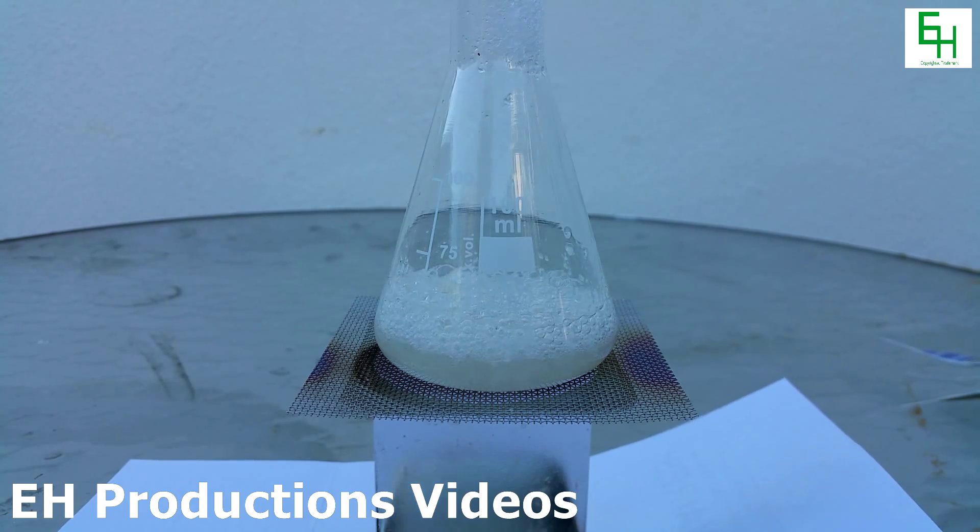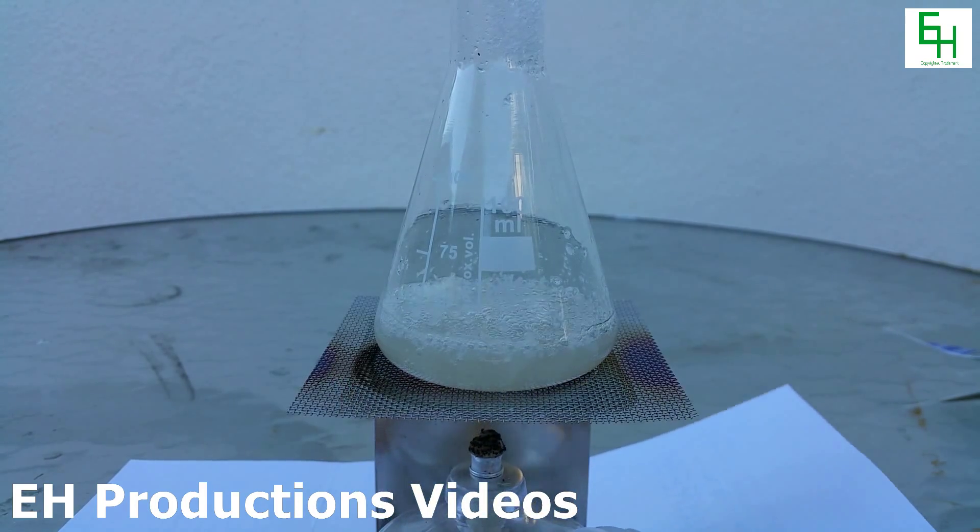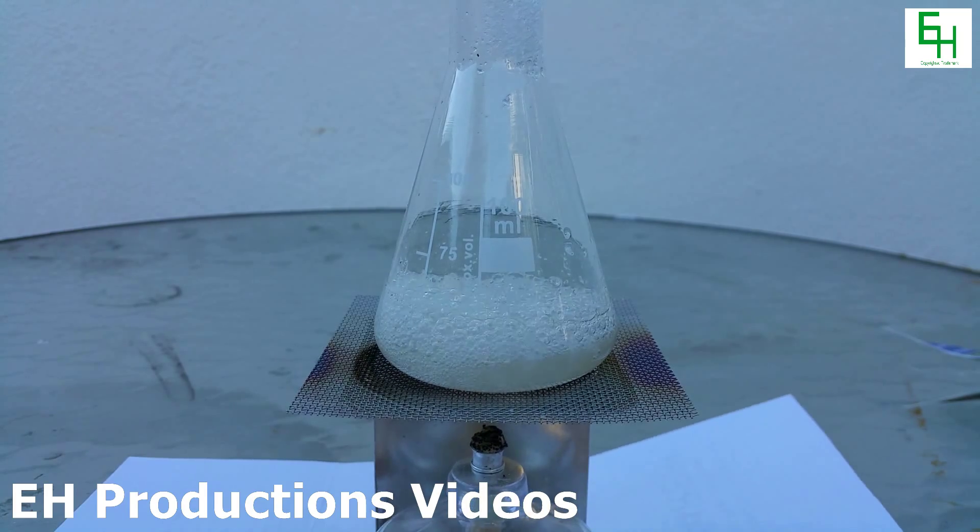So we're just going to continue heating it and taking away the heat until the mixture has, all the silica gel has dissolved into solution.